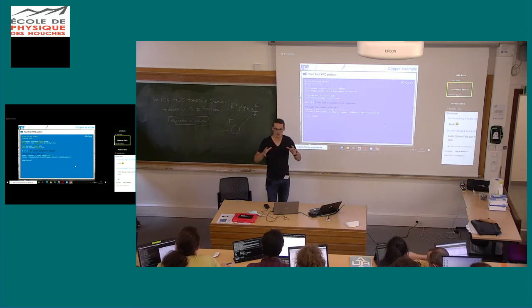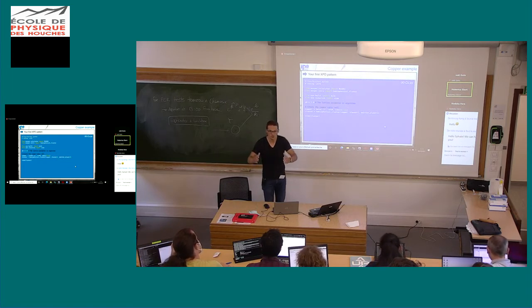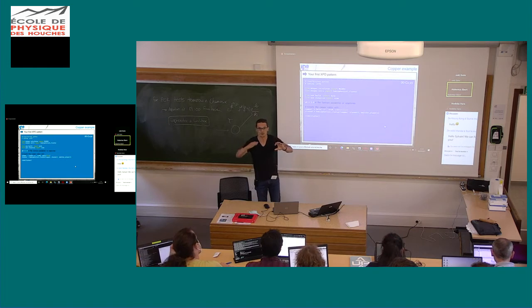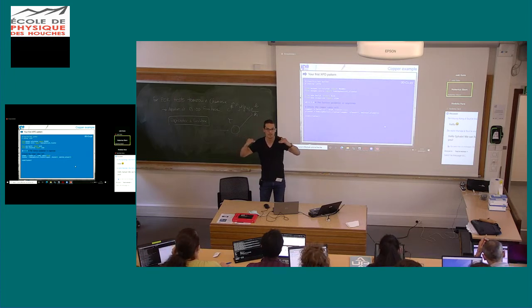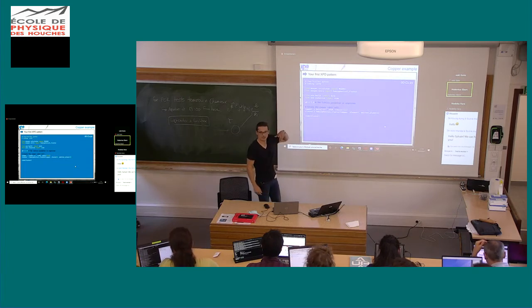It means that we need a certain amount of atoms that are shaped in a certain form. Usually it is hemispherical, due to the escape path of the photoelectron, so you do not need as many atoms at the bottom as at the surface. But you may also need a cylindrical cluster, for example if you are doing a calculation at high angle, grazing incidence, where you will need a large surface even for the first two or three planes below the surface. So this kind of function can be used to easily create a cluster.